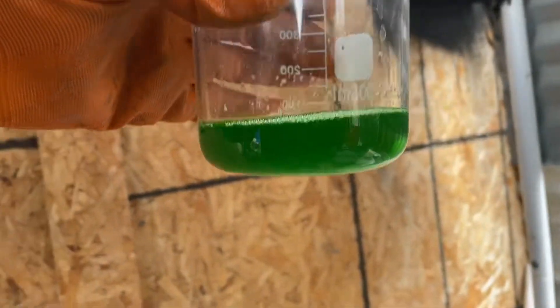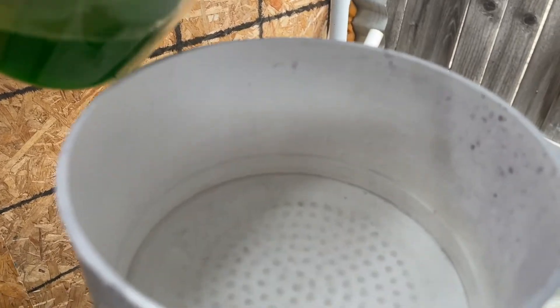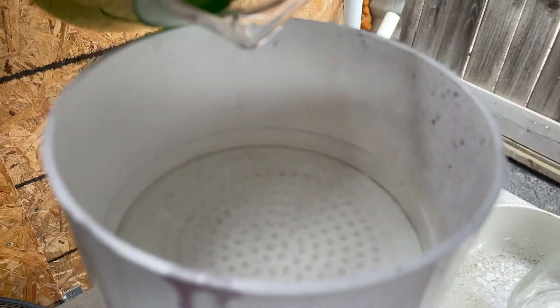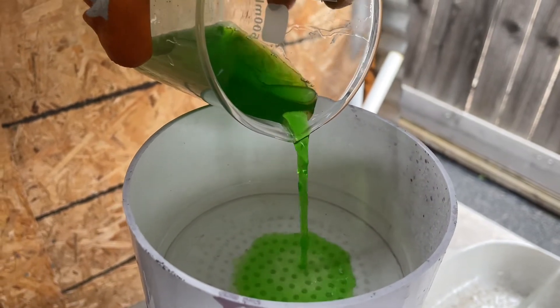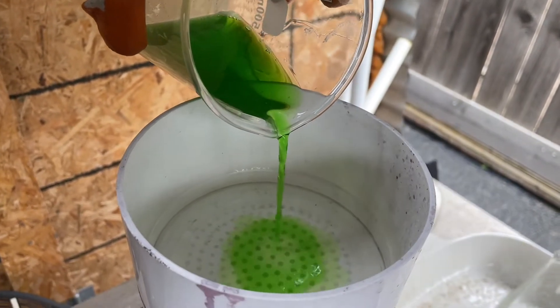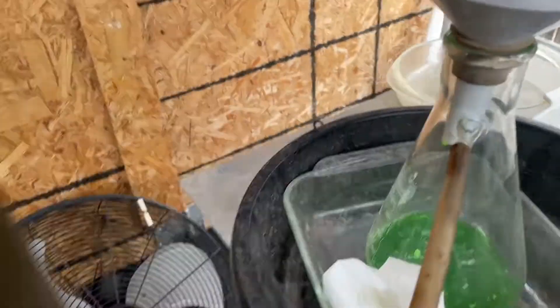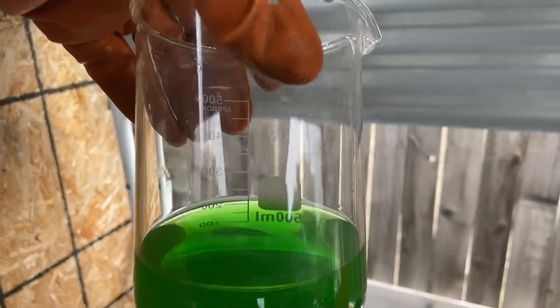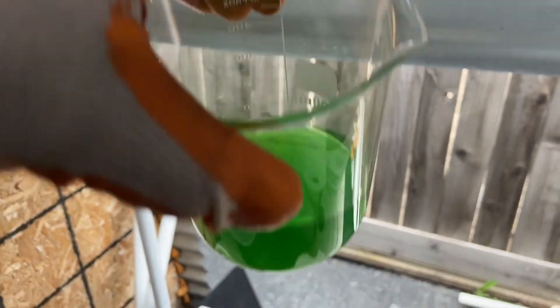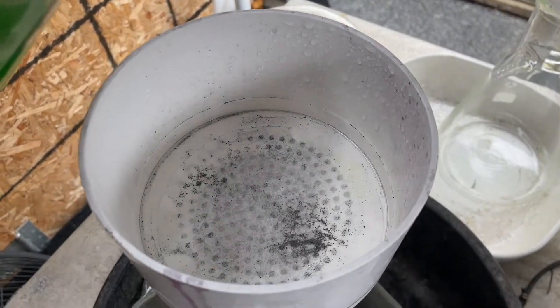Hey folks, I'm going to filter the solution — a little bit grody looking, very green, but got everything in solution. I'm going to filter it and then drop the gold, and then probably run it one more time to get it more pure. Yeah folks, it's a bit cloudy so I'm going to run it one more time right through that same filter.